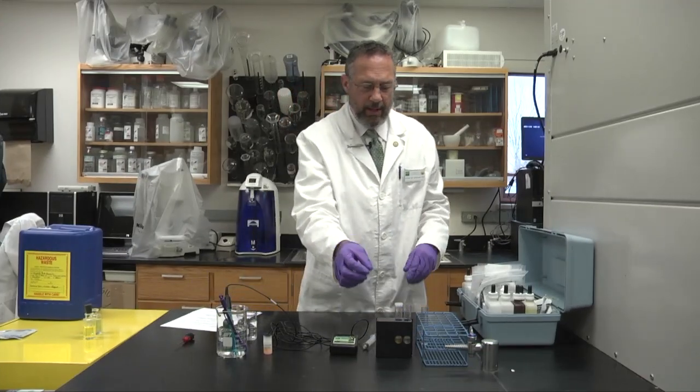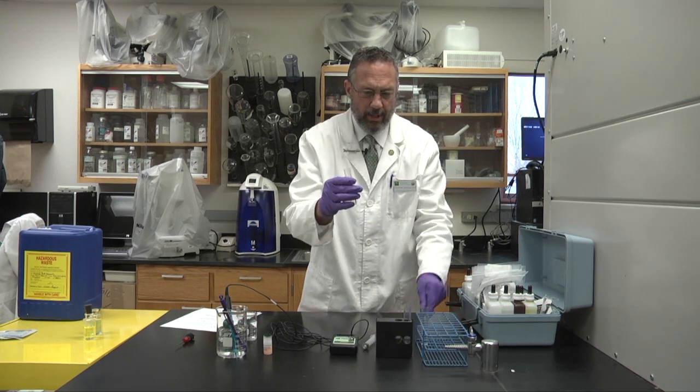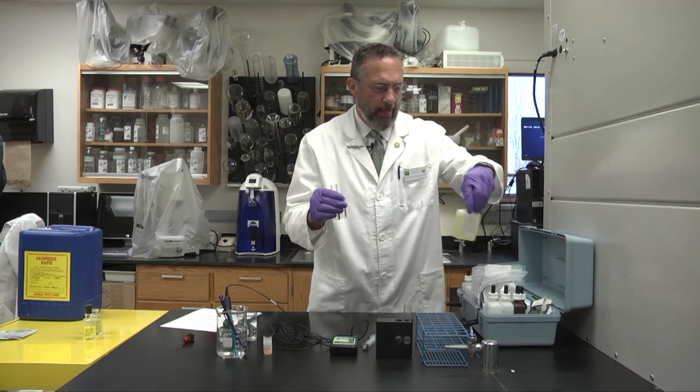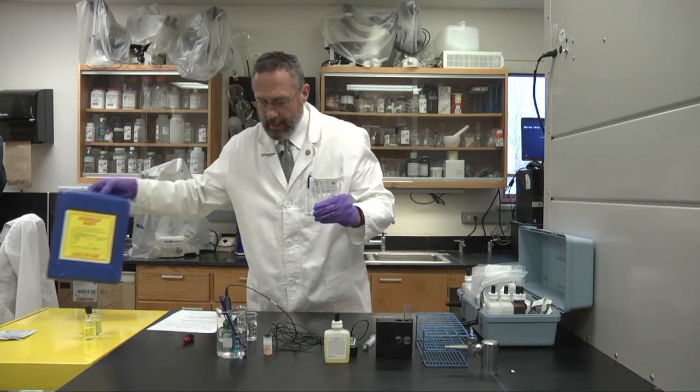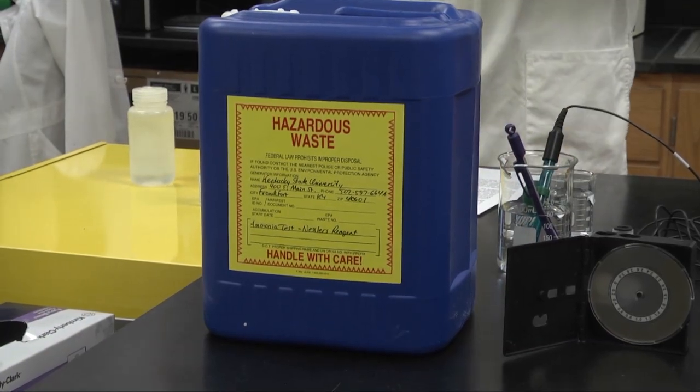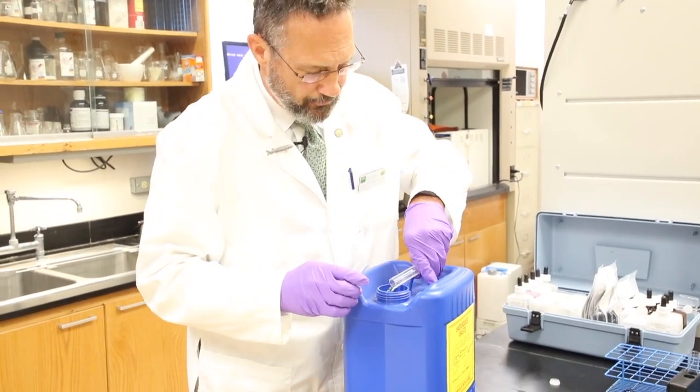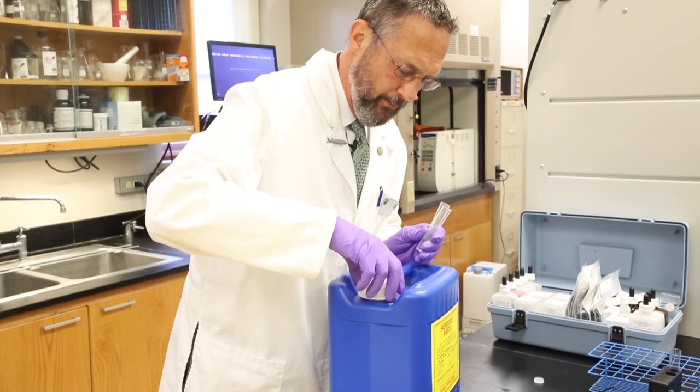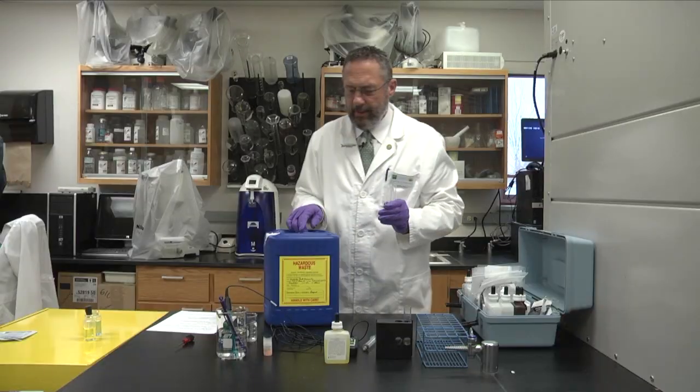When we're through with these tests here this is especially important. When we're dealing with Nessler reagent, Nessler reagent which we used in this test has mercury in it and this waste container here is specifically designed to hold mercury waste from the Nessler reagent. And these are very important procedures to do because we don't want to contaminate our water supply or aquifers in the state might get contaminated if we simply dump these down the sink.